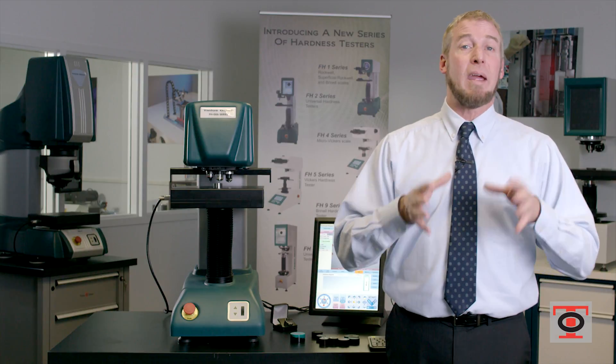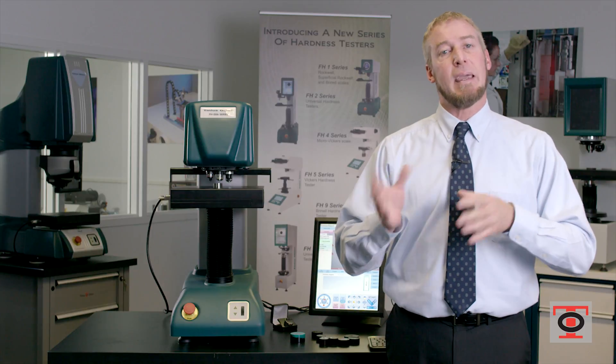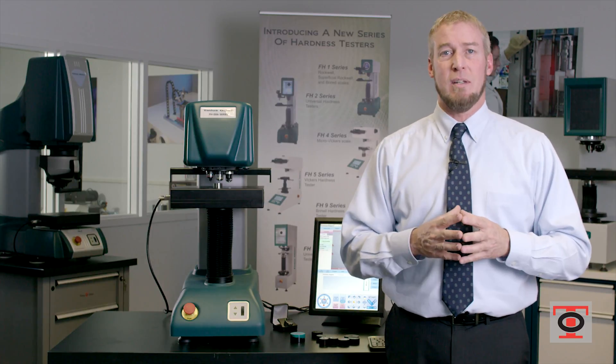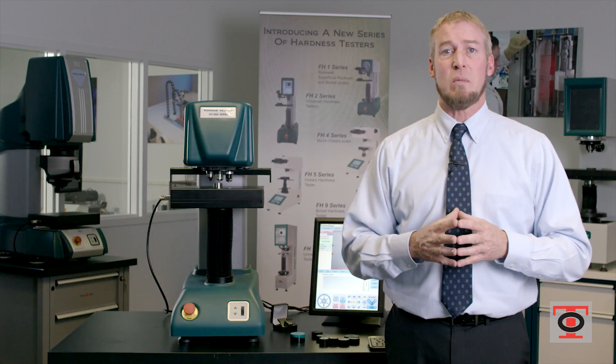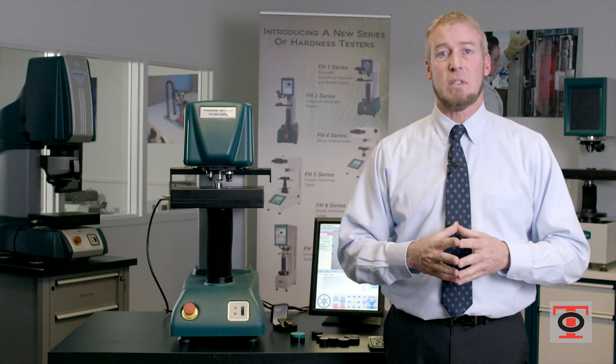This not only saves you money by having one machine instead of multiple machines to do different types of tests, but going back to the automated feature, you now can have one person performing this test and doing a function somewhere else once you have set it up and asked it to perform the test.